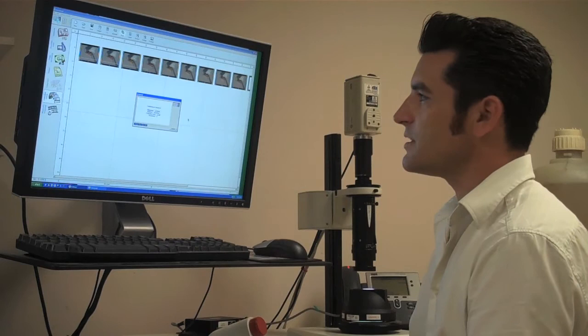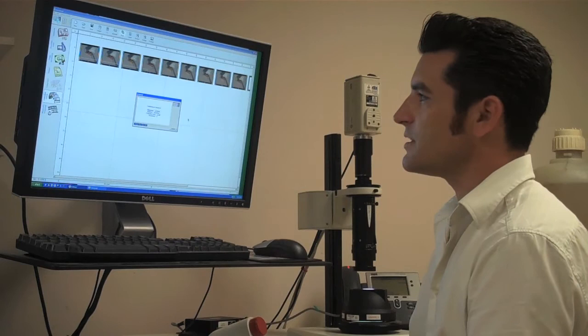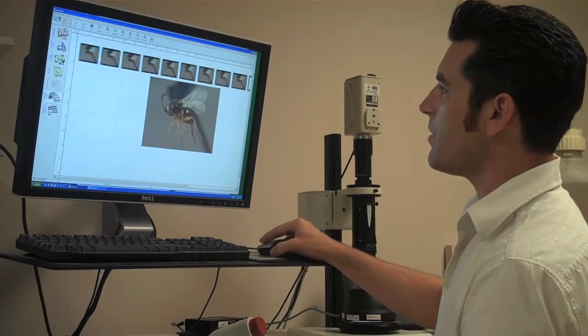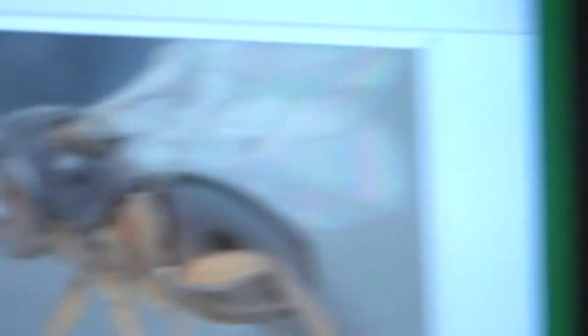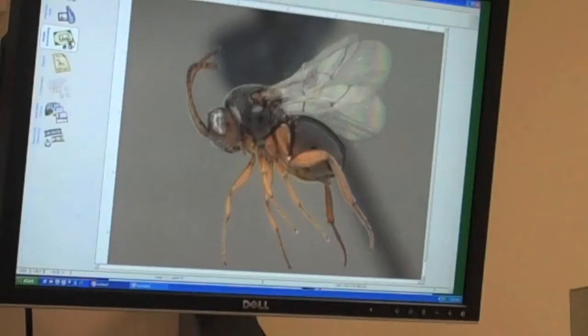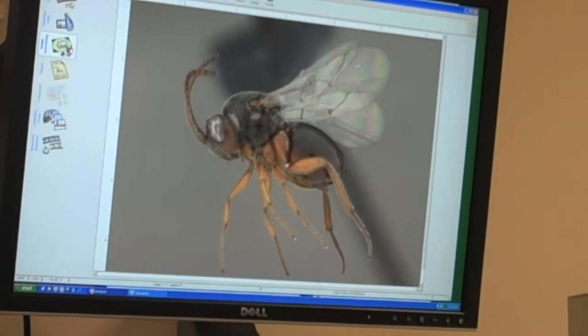So it's pretty fast. These images are about five megabytes each. This is our composite image. And this is the result. This wasp is about two millimeters long. It looks like any other wasp that you might encounter, yellow jackets, etc. It's just tiny. And it happens to be a parasite of another wasp species that lives inside of mimosa plants in the desert southwest.